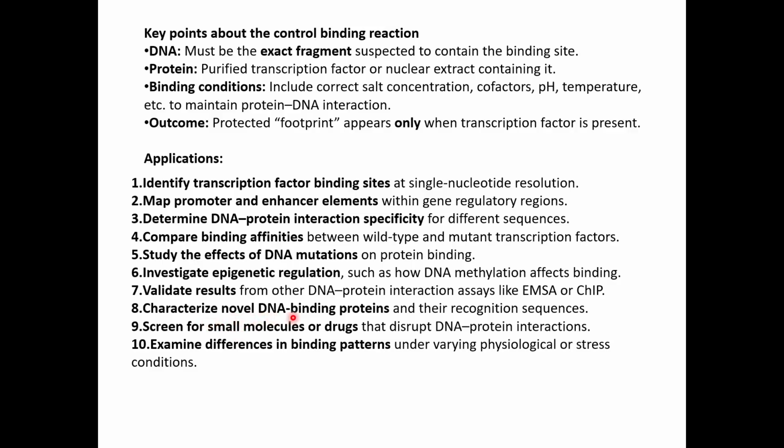Then to characterize novel DNA binding proteins and their recognition sequences. Like if you have a new protein, you don't know whether it binds to the DNA or not. You can try it out in this, and eventually you can see if it is bound, your digestion pattern will change. Then screen for small molecules or drugs that can disrupt DNA-protein interaction. So this is also one interesting application that you can see in drug testing, to see if small molecules interact with any sort of DNA and protein complexes.